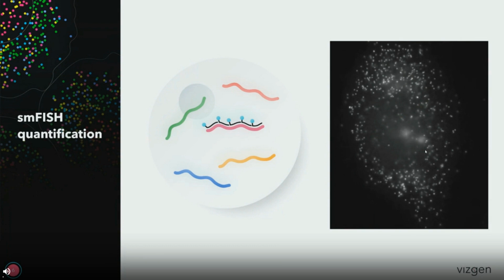By directly counting the number of RNA molecules that fluoresce, we can determine the expression profile for each individual gene, as you can see from the image on the right. smFISH is very well known for its sensitivity and often considered the gold standard for quantifying RNA copy numbers. The limitation for smFISH, however, is that the plexing level is very limited, often less than 5.